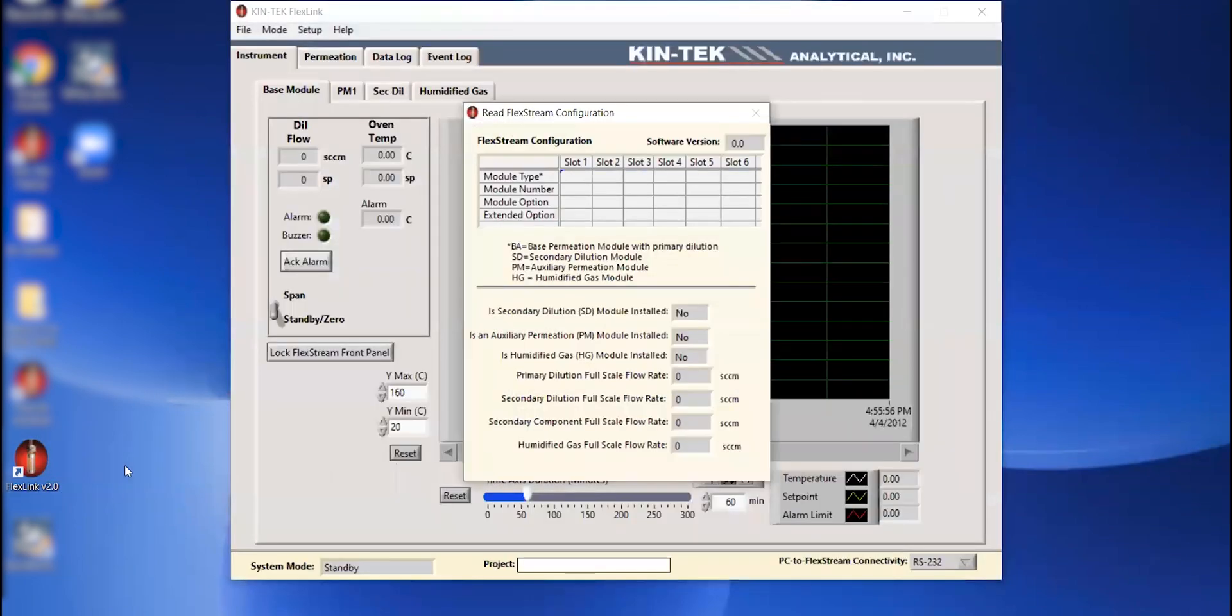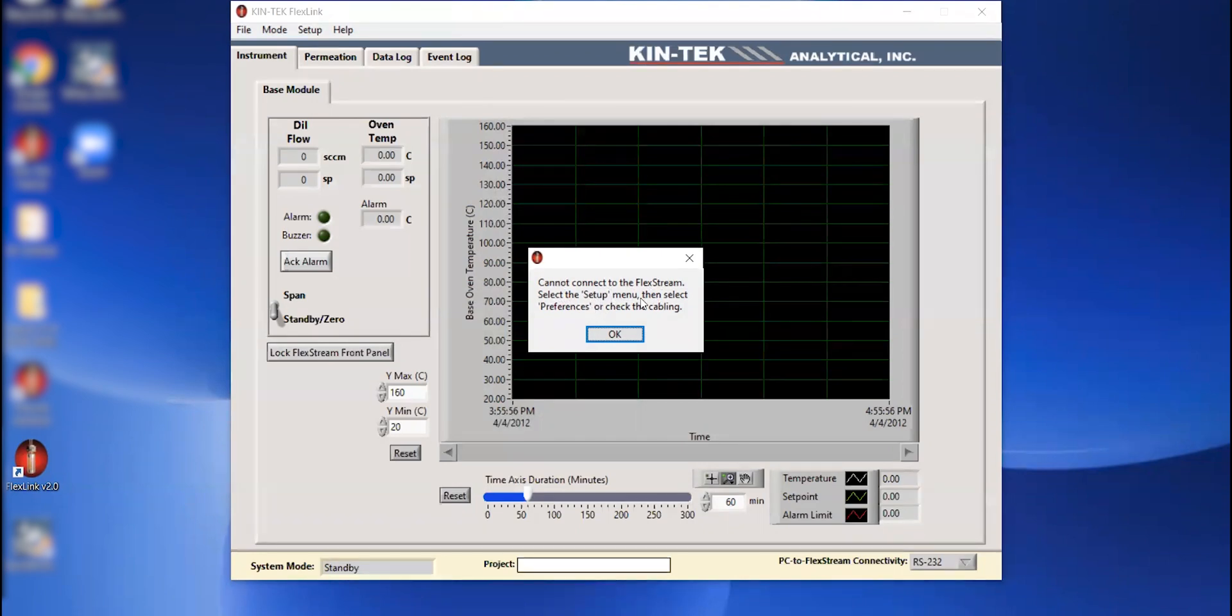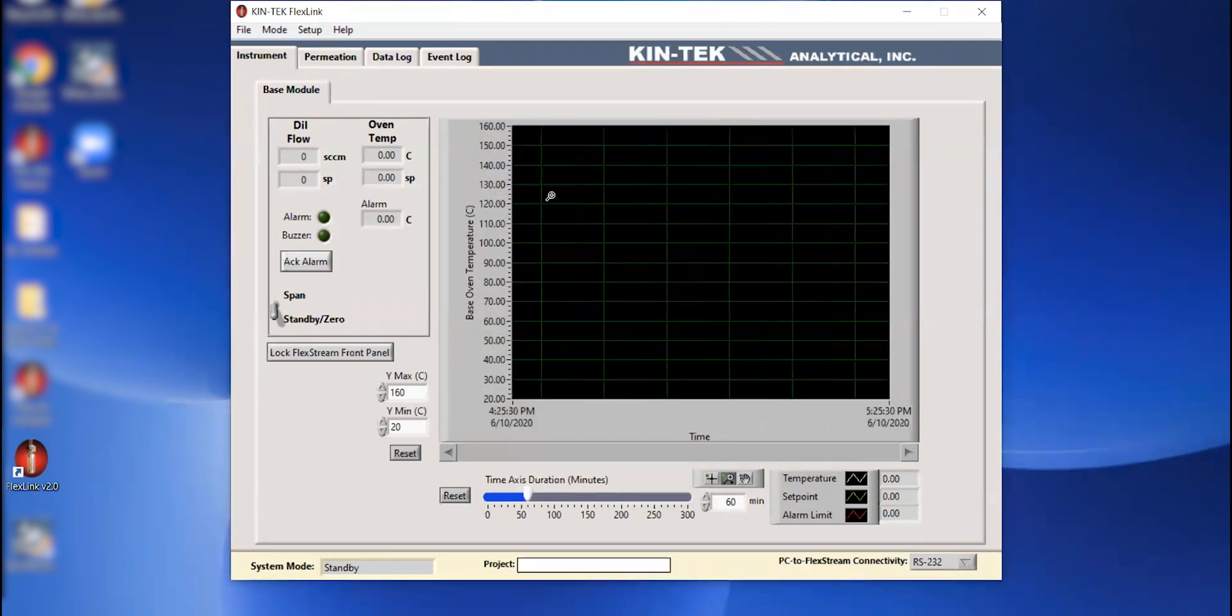remotely. So I'm going to go ahead and click on the FlexLink version 2.0 software. The software is going to try to connect with the instrument. We see a warning here says cannot connect to the FlexStream, to go into the setup menu and then select preferences. So we're going to hit OK.